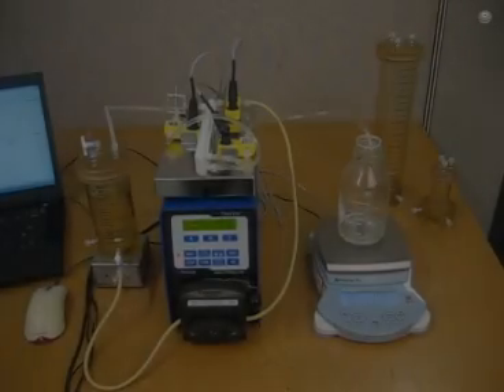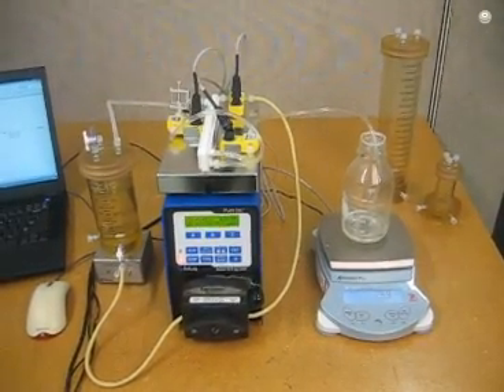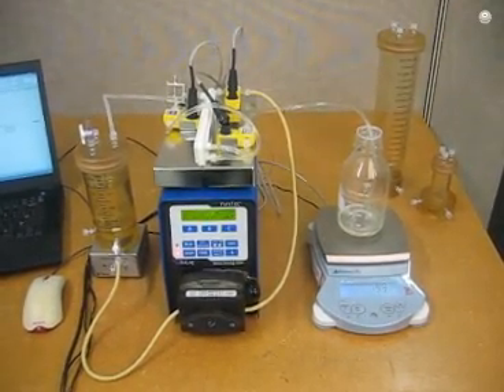Hello, this is Sean Mitchell. I am the lab systems product manager. I'm here today to talk about the PureTech TFF system. The PureTech system is a software driven laboratory scale TFF system.